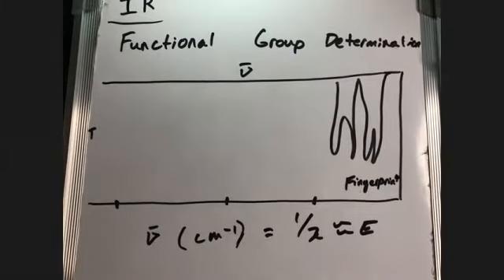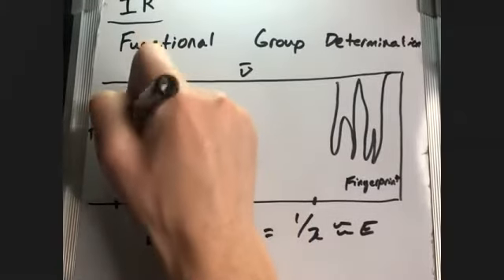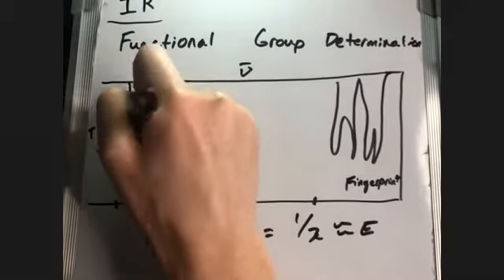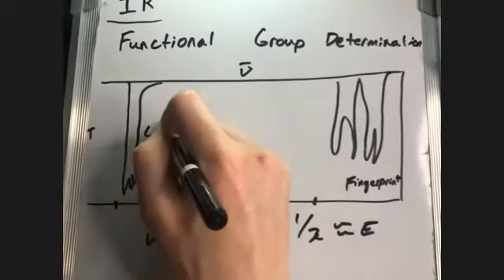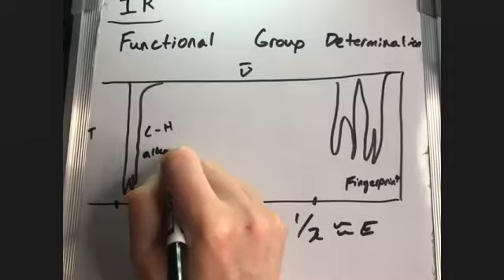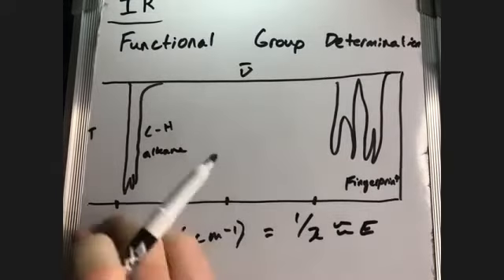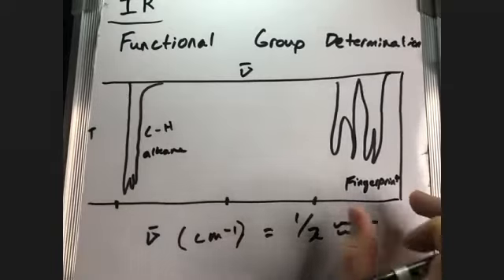And then at around 3,000, right before it, there are strong peaks, and these are carbon hydrogens stretching of an alkane. So any organic molecule is going to have CH stretching pretty much. So basically what I'm saying is you're not going to get a bunch of information from right at 3,000 or before 1,000.